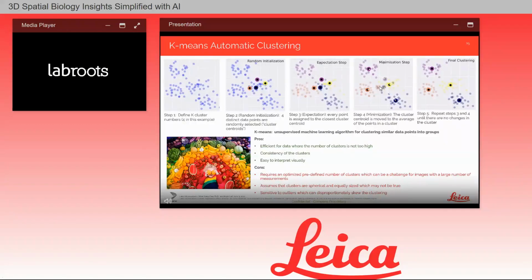For example, this orange object here may now be closer to the yellow centroid. In that case, the steps are repeated from step 3 such that the assignment's made to the closest centroid. Then this cluster centroid is moved to the average of the points in the cluster yet again. The steps are repeated from steps 3 and 4 in this iterative fashion until there is no more movement possible. It's a fairly robust algorithm, and the results are usually easy to interpret as you see here.